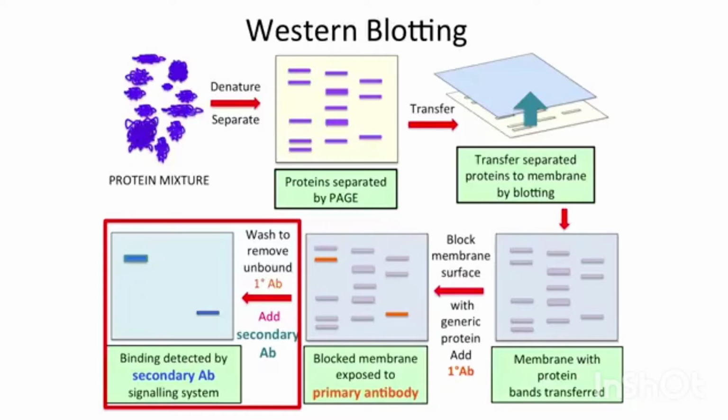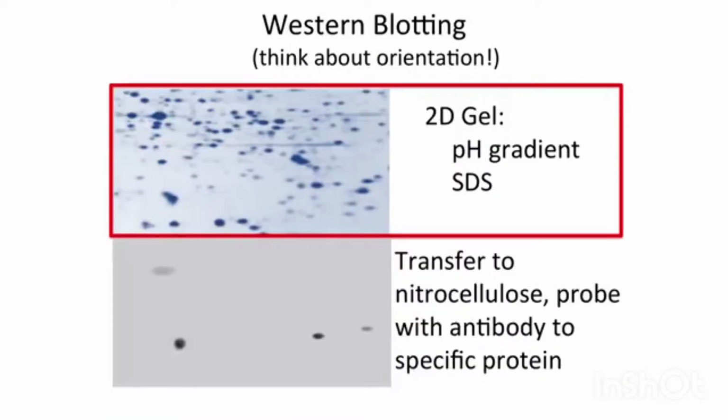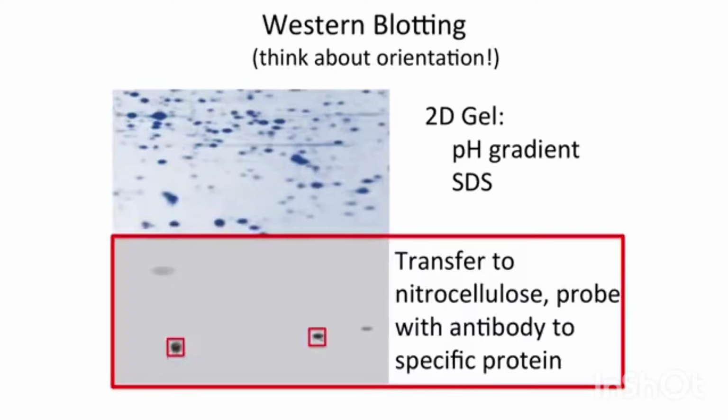So you can find on a polyacrylamide gel, using this Western blotting method, exactly where your specific protein is and in what amounts. And that can be applied in a variety of settings. You can also do it with 2D gels, where you run a pH gradient and then the SDS gel, and you transfer it to the nitrocellulose, blot the nitrocellulose with nonspecific protein, wash it off, bind your antibody, wash it off, and then use your detection system, and you can see a subset of this whole mixture of proteins can be identified. So if you want to know, for example, where in the cell is your protein, or what in a particular mixture of proteins is your protein there, this is a very powerful method and a very sensitive method for doing that.